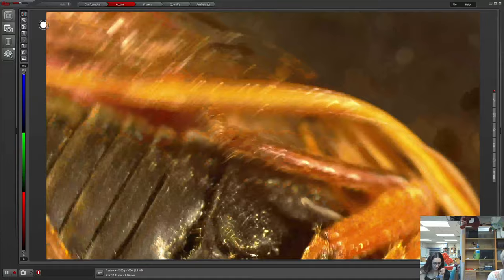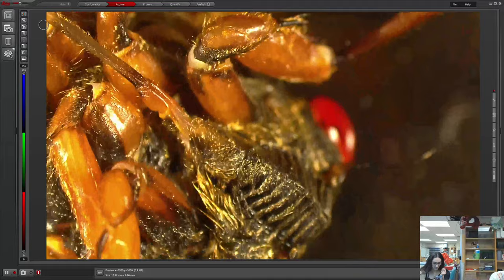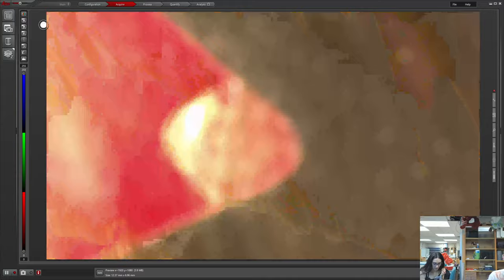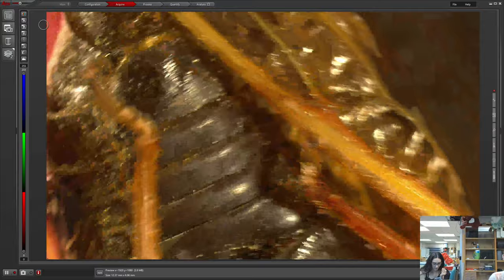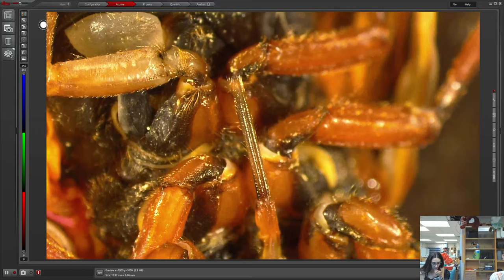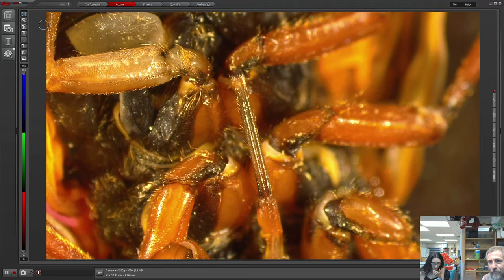This one's alive. Its wings are a bit messed up because it went out into the rain, and its wings didn't straighten out perfectly. I want to get it away from the edge of this Petri dish a little farther, so we can kind of see the whole thing. There's its little mouth — can you see the mouth?